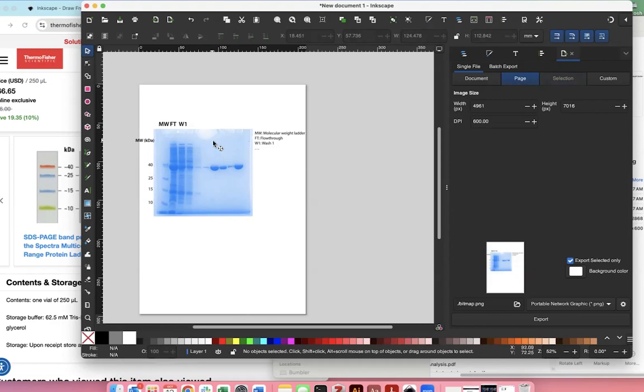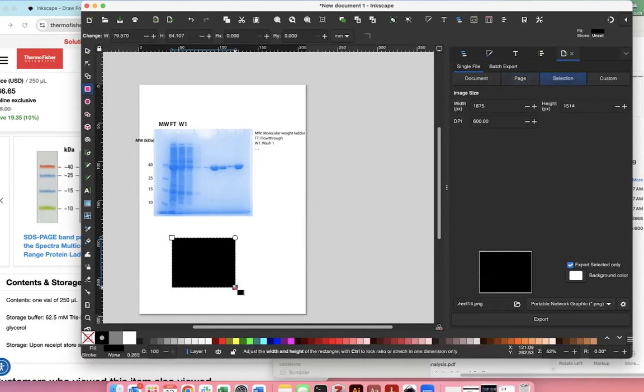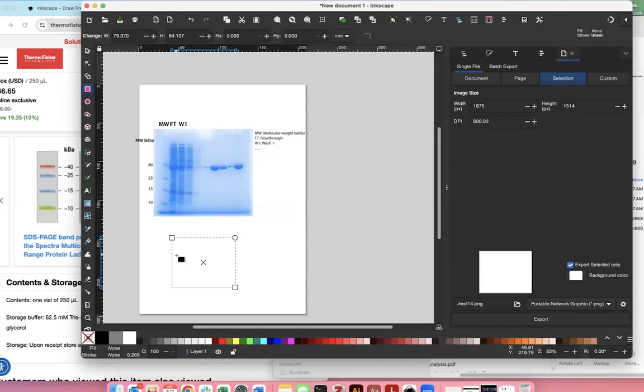If you want to crop the picture, you come over here, you select the rectangle tool. So remember down here, this is controlling your fill and your stroke. So right now I have this black rectangle, which just might not be what I want. But what I can do over here is I say I want my fill to be none. But now it still doesn't have a stroke. It has stroke of none.